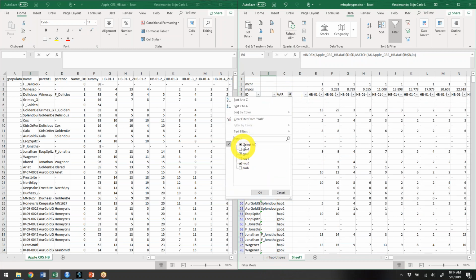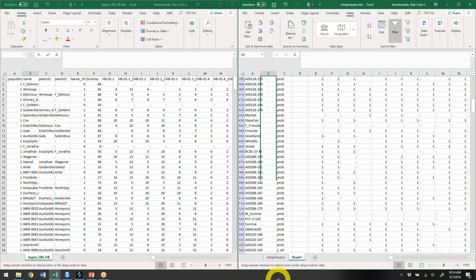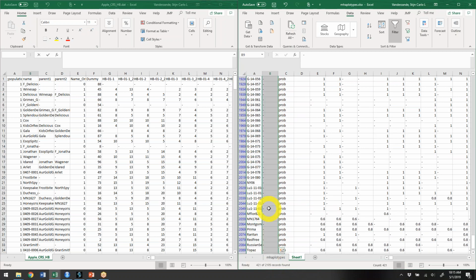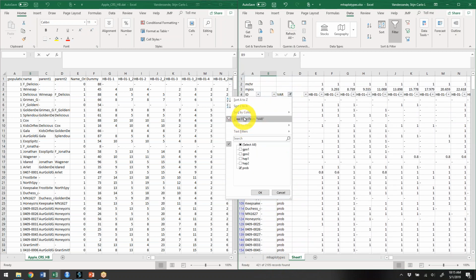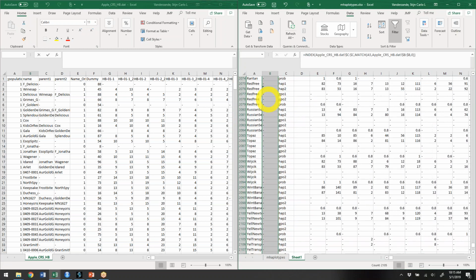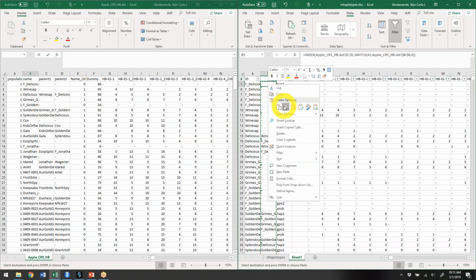And at that point, I do want to also go in and look at the probability row, which is not attached to either, or it's attached to both parents, not to just one. So I'm not going to fill in either one, but I'm just going to make sure there's something in this cell, just because it makes it much easier to select things in a column if all cells are filled in. And then the last thing I do is just copy paste this with values so that the formulas are gone.